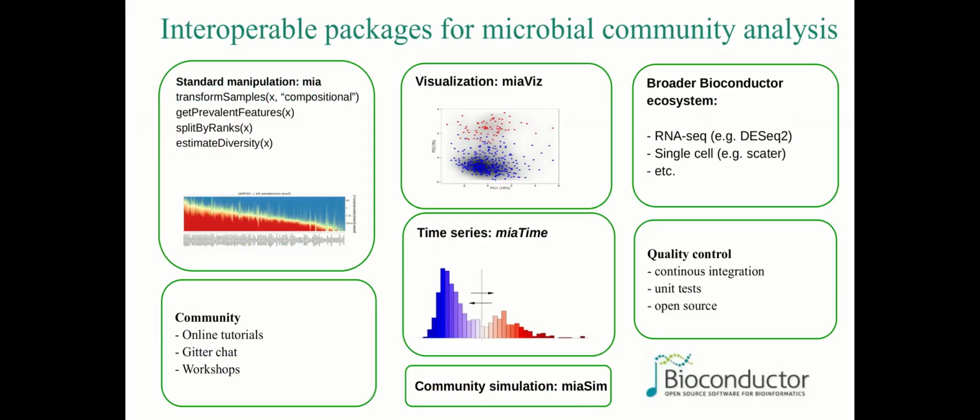Then there are the interoperable packages for analyzing such data. There are several different R packages that can be used for these purposes, and they provide techniques for data manipulation, visualization, and differential abundance analysis, and many other things. It is not only the packages that have been built for the microbiome analysis, but we can also utilize tools from RNA-seq, single-cell communities, and other communities that use similar tools and techniques.